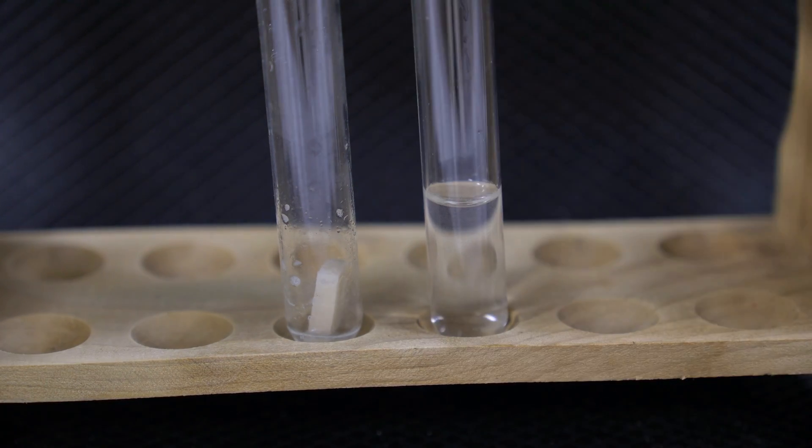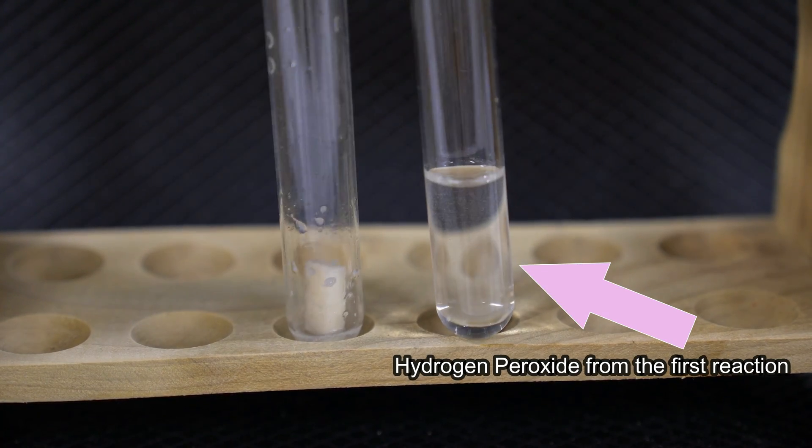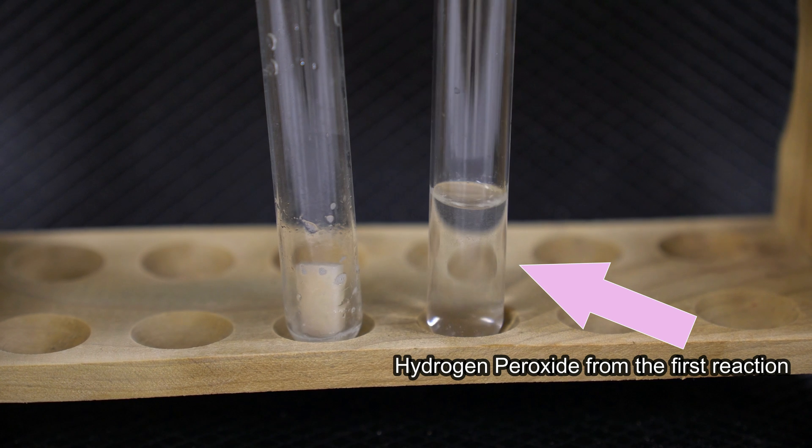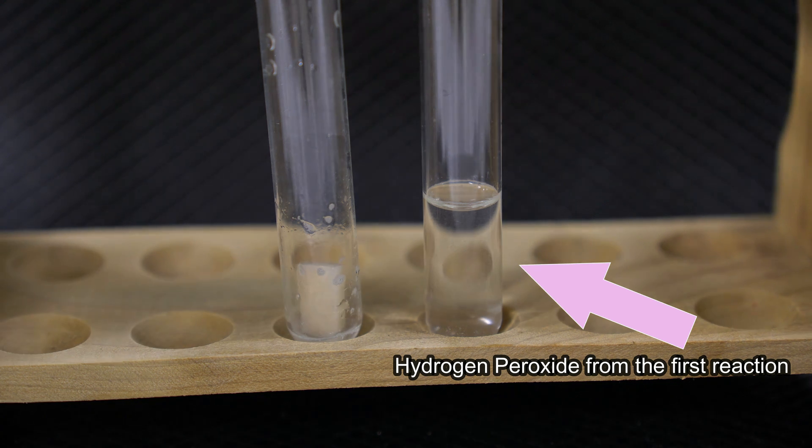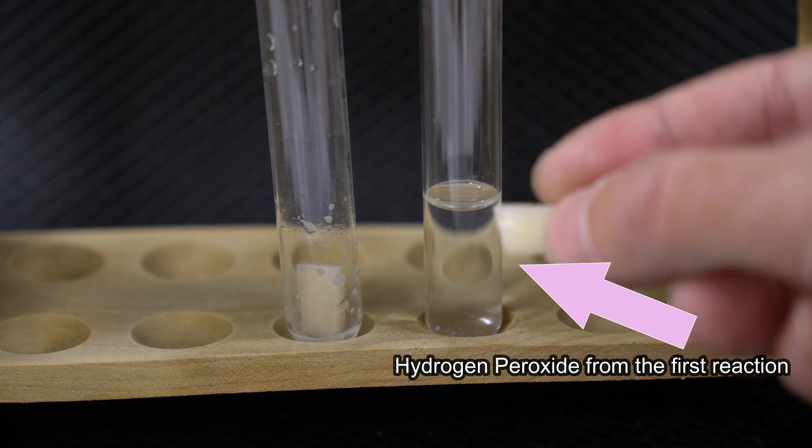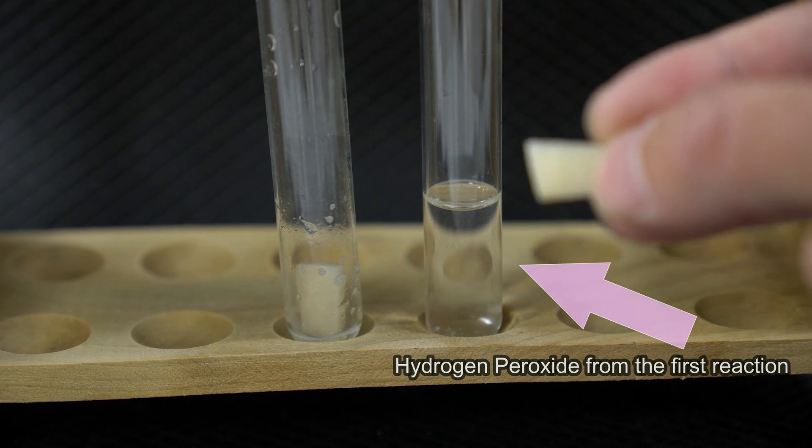Okay, so now I've got the liquid poured off from the first test tube into the second. The question now asks, what would happen if I added another piece of potato? I've cut a fresh piece of potato of similar size, similar surface area. We're going to add it to the test tube and see what happens.